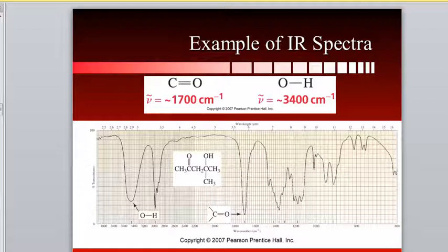These are very specific to each and every molecule. Now, there's a few that we can talk about, but not very many. And we will talk about a few of those. But for the most part, 1400 and on down to 600, we kind of ignore. And we don't really have to pay attention to those at all and talk about functional groups there.